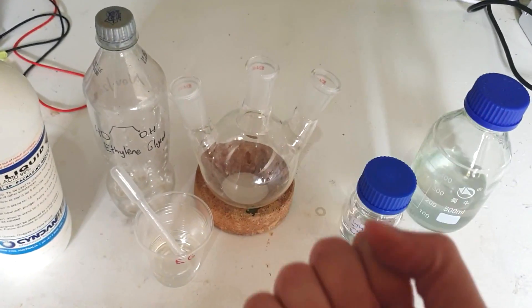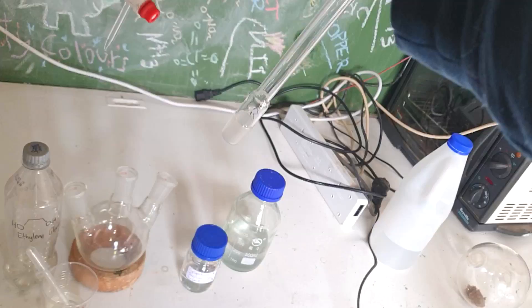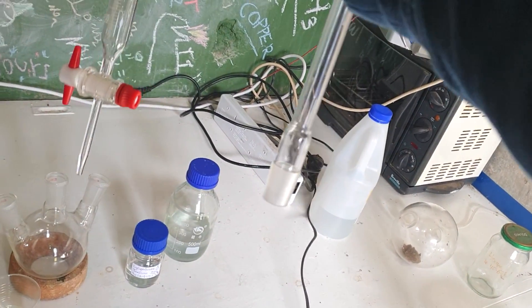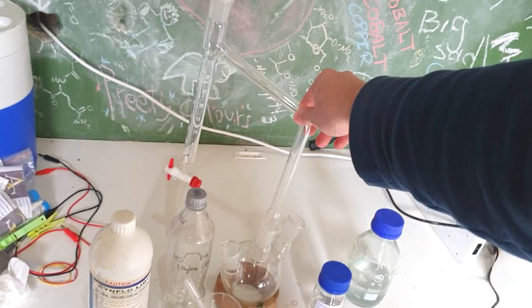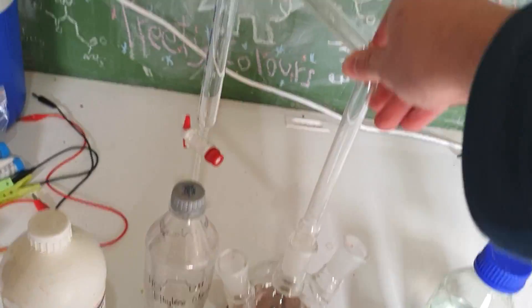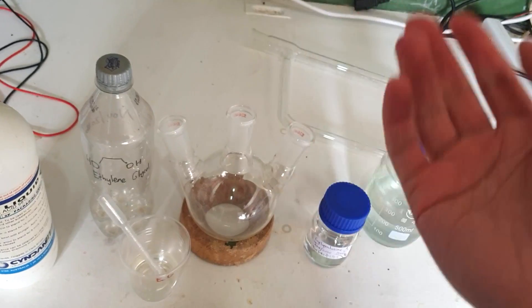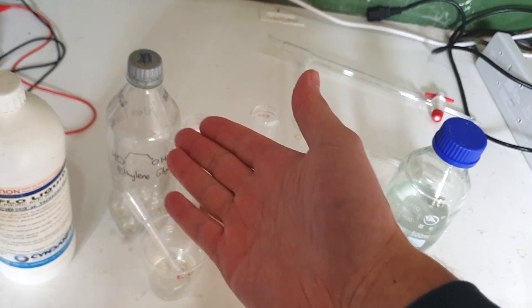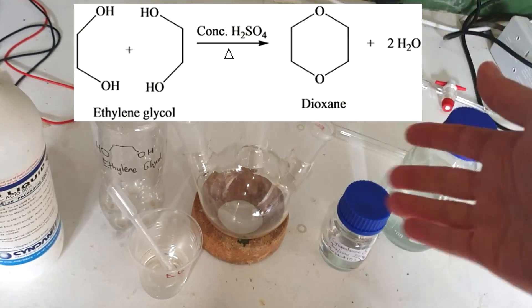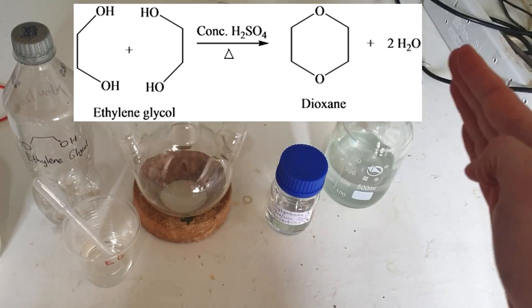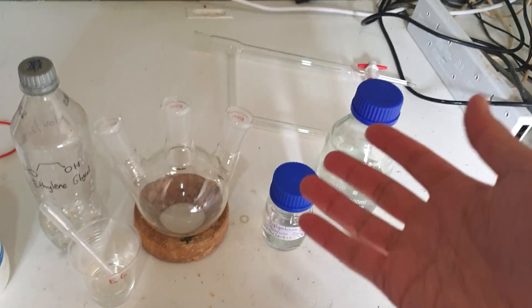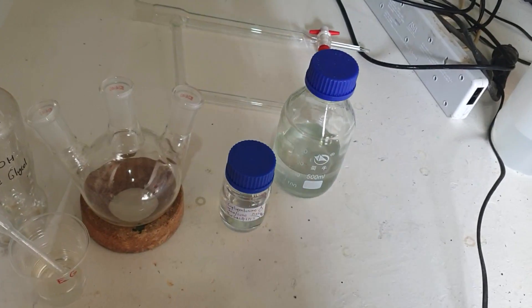We're going to put it all in there and reflux, but we need a special kind of reflux because we want to remove the water. I've purchased a Dean-Stark apparatus. I haven't got one before because they're not that useful, but when you need one, it's really nice to have one. This is huge - I saw it and thought, oh yeah, 30 mil Dean-Stark trap, that's fine. That's fucking ginormous. This reaction is going to look weird because it's going to be tall as all fuck. I'm going to add everything except the ethylene glycol and set it up to reflux to see if we collect water. It'll be nice to dry it out first without the ethylene glycol because we don't want it reacting with itself to form dioxane.